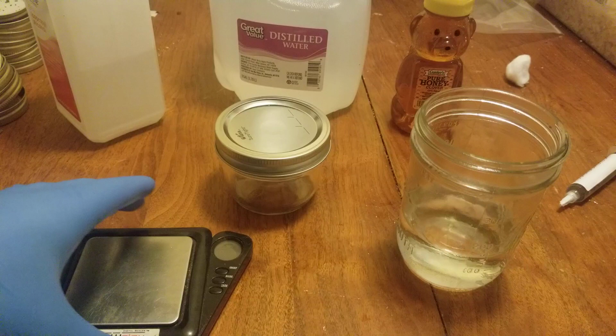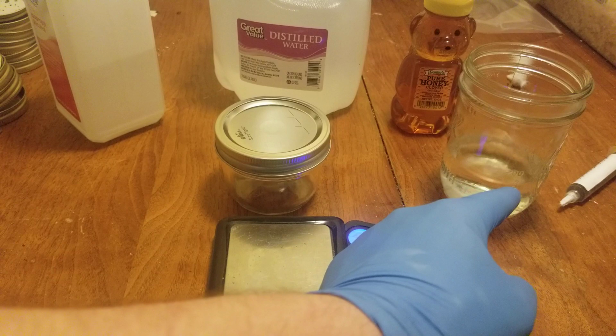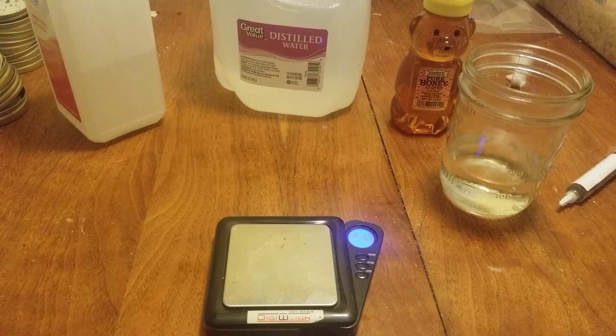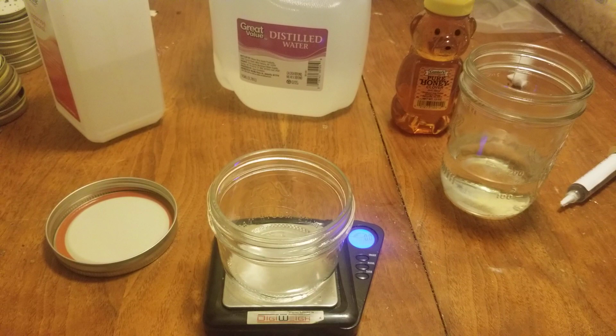All right. So first thing that we're going to do is pull up our scale and turn it on. And here is 150 milliliters of distilled water. Let me take the lid off this jar real quick, throw it on the scale. Perfect. We're going to tare it out. Perfect. All right.